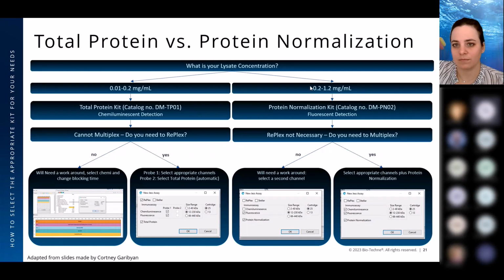Thank you. Oh, sorry, can I ask another question? Yes, please go ahead. It's a topic that is not fully related to this. Is there a particular reason why in Compass software, the normalization to total protein is only done to one of the capillaries, or that we can change, but it's still one capillary? Like, what if you're doing different samples? Isn't it more logical to normalize it to the total protein within each capillary? Is there a way to make that an option in general?